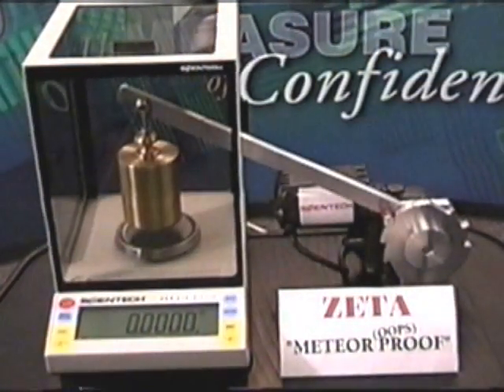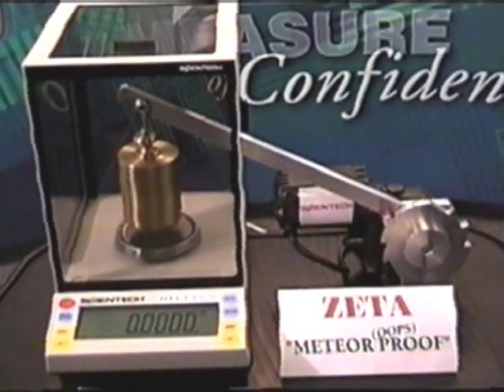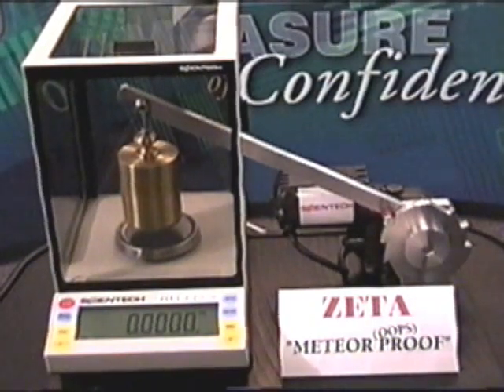Here we see a Zeta model, ZSA210. It has a capacity of 210 grams and a readability of 0.1 milligram — that's four decimal places. This is an analytical balance.